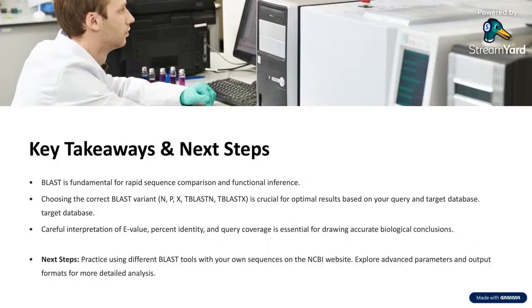First of all, you go to the home page of NCBI, click Protein BLAST, then paste your protein in FASTA format, like with the greater than sign. Then choose the protein database. You can adjust the scoring matrix or gap if needed.